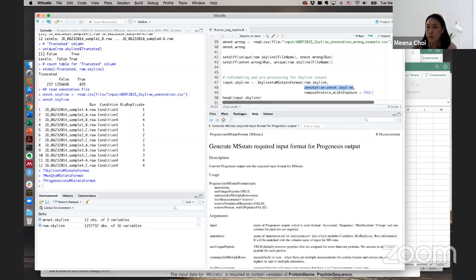Biological protein level summarization we can cover a little bit later. I already mentioned we cover up to eight data processing tools. I know you also have a lot of data processing tools that report quantification, or you may have in-house software you want to cover.